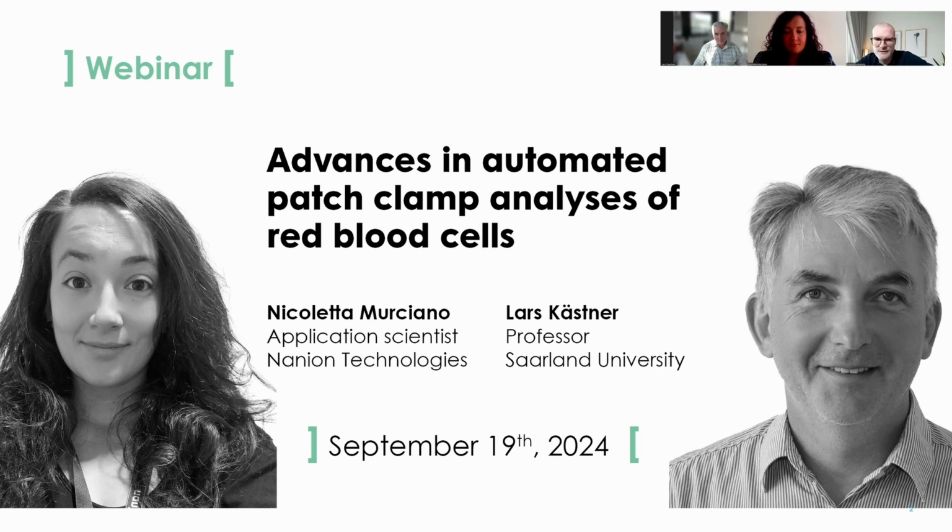Yeah, why not? I think the calcium oscillations Anna refers to are calcium oscillations that appear when you place red blood cells from a calcium-free surrounding in a calcium-containing medium. Then suddenly you see some calcium flashes and maybe oscillations. I think this is still not yet really explored.